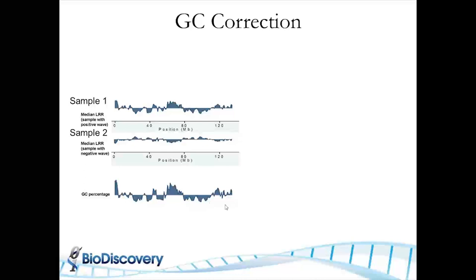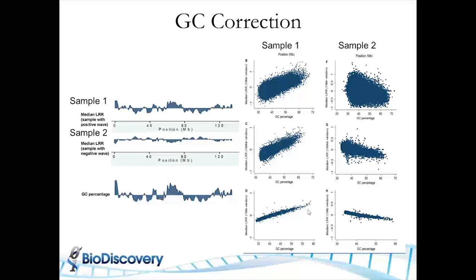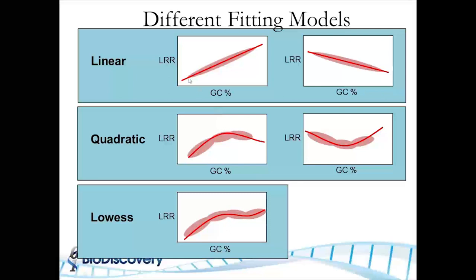What people did back then was look at the GC percentage across chromosome 11 as an example. If you look at sample one, there's a very nice direct correlation: when you have more GC in a region, you get a higher log ratio value, and if you have less GC, you get a lower log ratio value. For sample two, it's actually the reverse. If you plot that out, you can see it's a nice linear relationship. Once you understand that this is what's causing the variation, then you can do a systematic correction to make it nice and flat.